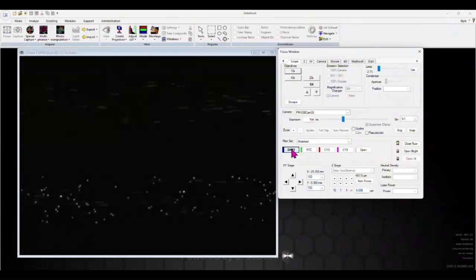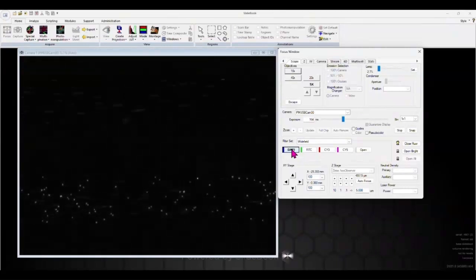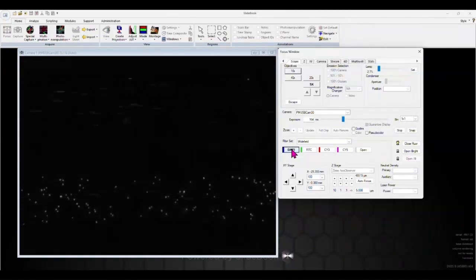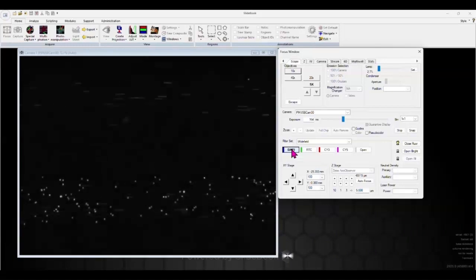For now, we're going to let the Jurkat cells flow through the microfluidic channels and adhere to the TNF-alpha activated monolayer on the bottom. We can see that a lot of them have stuck already. So we're going to give the cells a few more seconds before we stop flow. And once we do, I'm going to show you how we acquire time-lapse images to increase throughput.